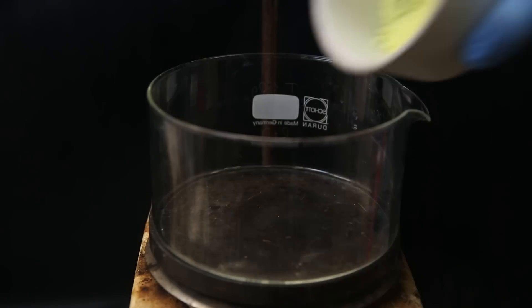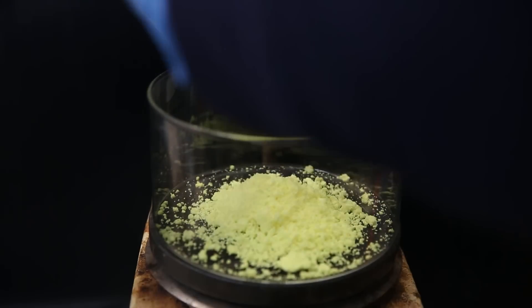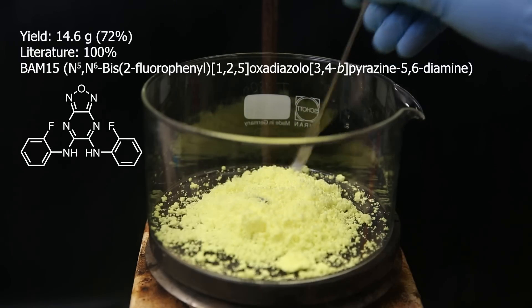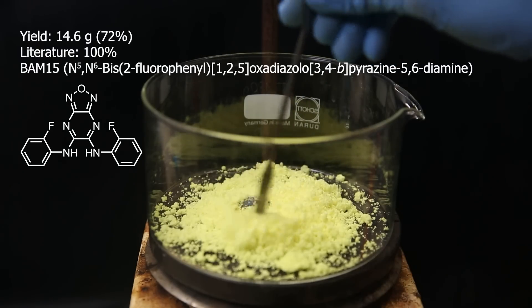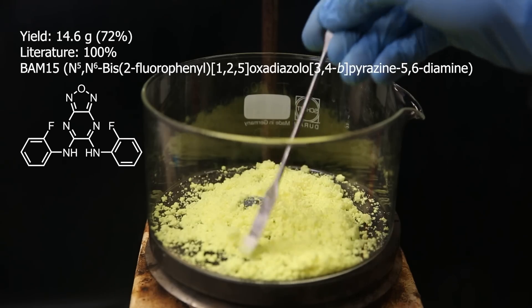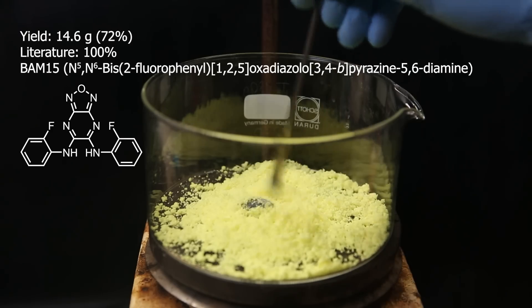When that's done, I transfer it all to a crystallizing dish under light heat to evaporate the remaining solvent, and the yield of BAM-15 turned out to be 14.6 grams, which is 72%. In literature, they really tried to get absolutely everything out, so they got a 100% yield, but I don't really have to bother with that. You can do that if you want to.